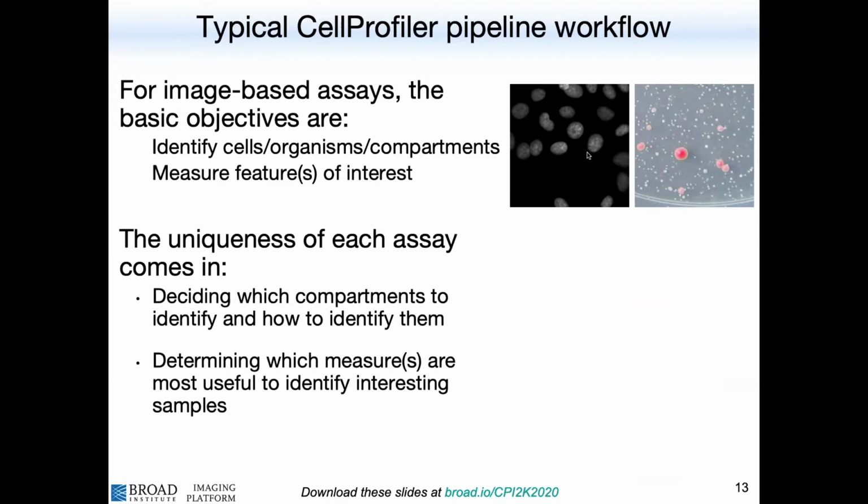For example, in these two top images, on the right we have the yeast pond, which has these round-shaped colonies. These are round, like the DAPI stained nuclei in the left image, but this image is 3-color versus 1, and the colonies are various sizes, whereas the nuclei are all pretty much similar in size.